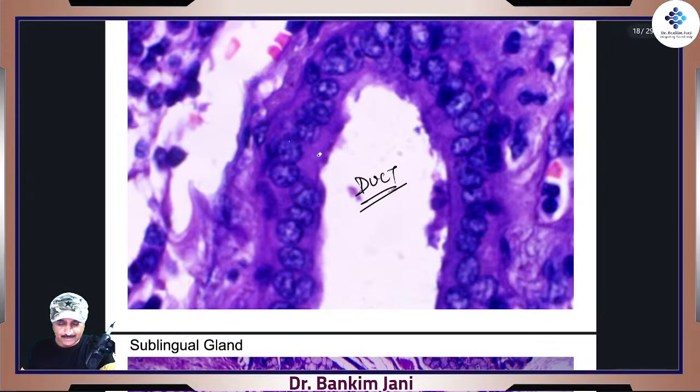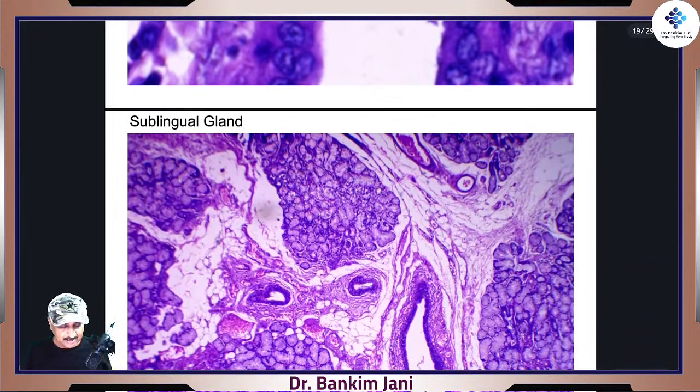So this is like cuboidal. Three glands I told you. One was parotid, that is a major one. So one is parotid, second is submandibular, just underneath the mandible, and sublingual, just underneath the tongue. Lingual is tongue, right? So we have got three glands on both sides, right? Two parotids, two submandibular, and two sublingual. What you watched is parotid. Parotid is a bigger one. We move on to sublingual.